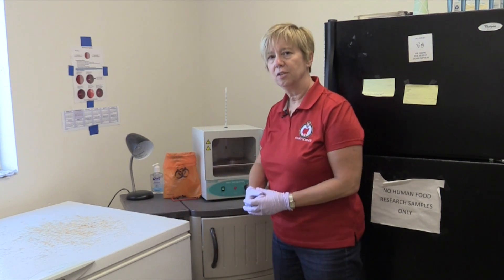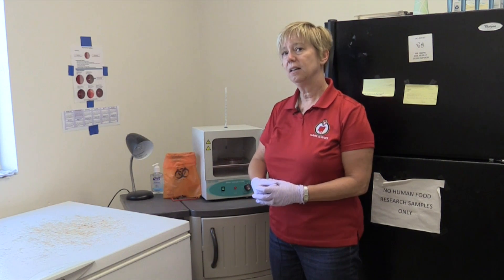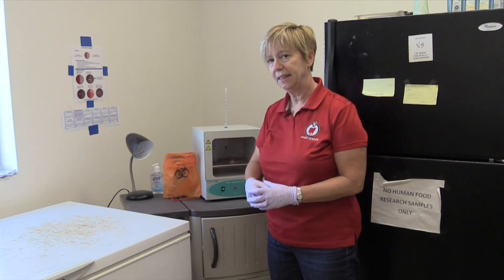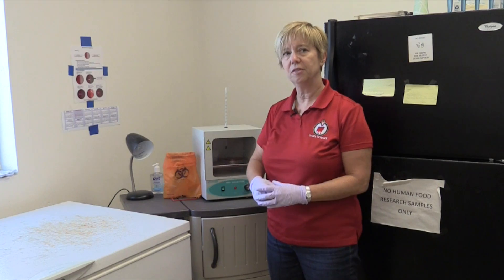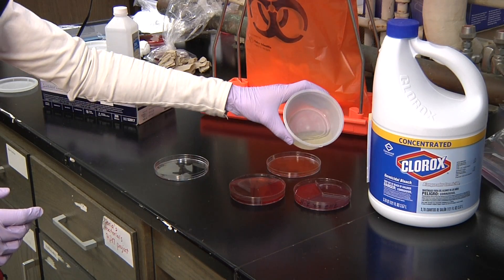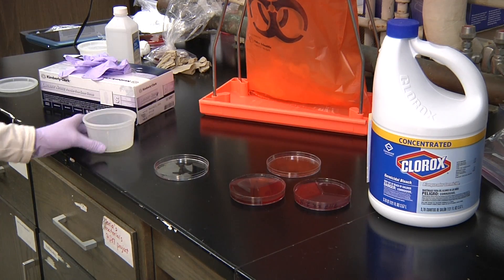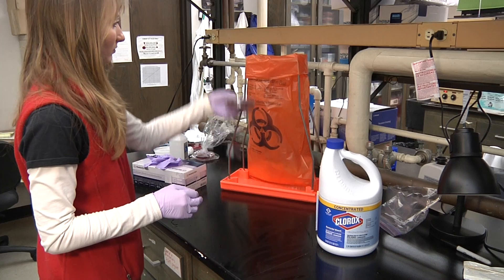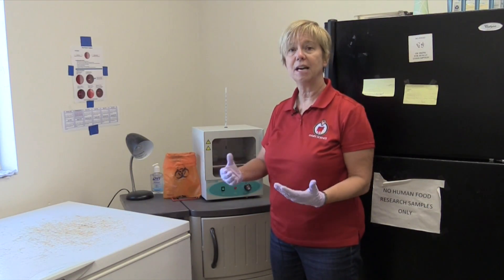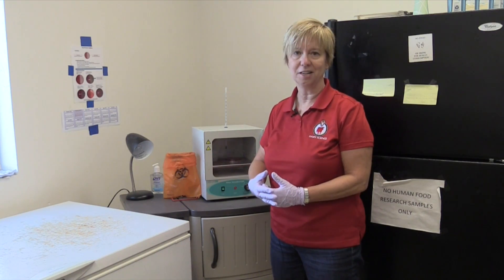We also have to consider disposal of the used plates. Local regulations will vary on that. In many areas, however, the simplest way to dispose of these plates is to flood each plate with bleach in order to kill the bacteria, then seal that plate using tape. After that process, those plates can be disposed of in a normal fashion, or in some instances they may need to go to a local waste incinerator.